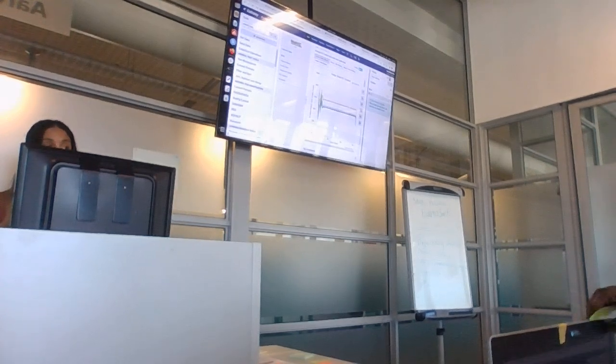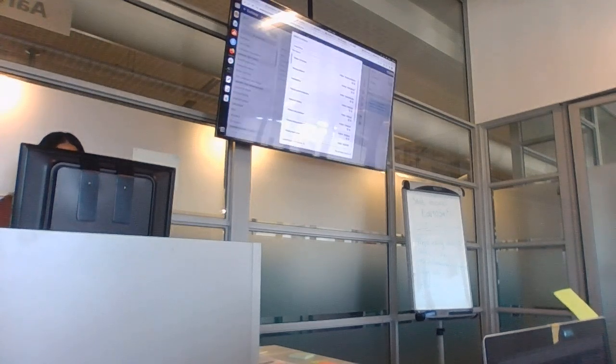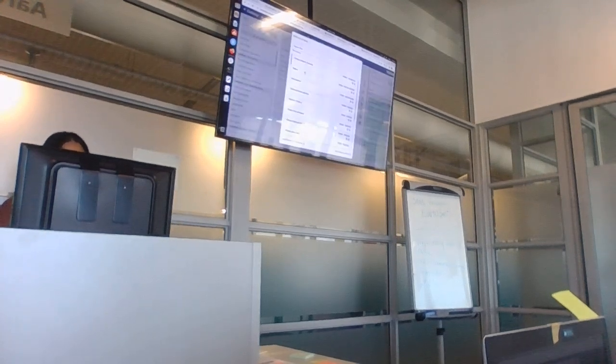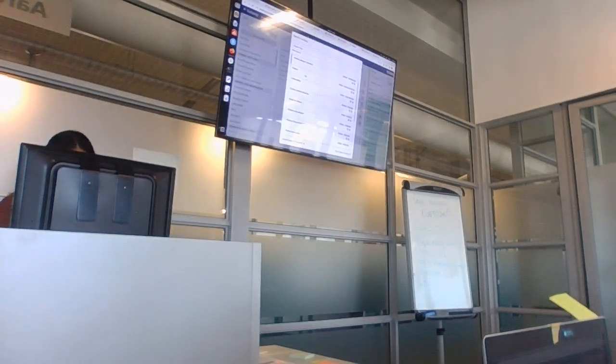Okay, now, maybe I should have done that because you don't have it yet. Into your old history, just to show you something. The one that you made, the cholera dataset. Go to the other history that you had, the previous one, the cholera dataset, and this will populate here. I want you to click on, because I don't think you'll be able to open this. Let me just first check something because maybe it's possible that you could open it.